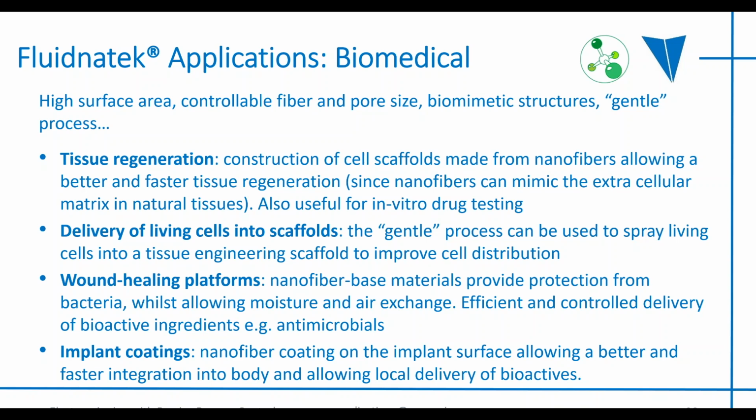It's also possible to deliver living cells through the process, so you can simultaneously be spinning a fibrous scaffold at the same time as depositing cells into the scaffold, so that it's a pre-seeded structure, and you don't have to then find a way to seed cells into the center of the scaffold.